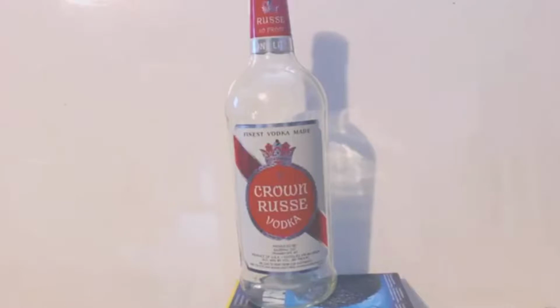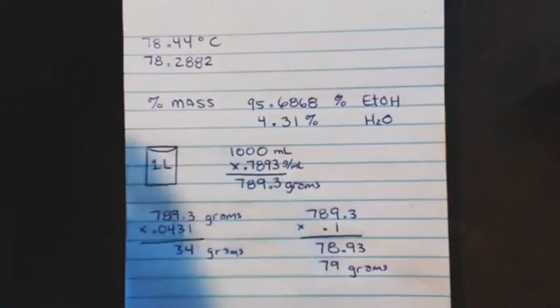Well, there it is. That's what I usually get, just some vodka, regular. Obviously, if you can get better alcohol, with a higher proof, do so. This is just what I had laying around, so I put it in the video. I get vodka because it's the cleanest alcohol you can get. Don't get those colored whiskey or rum or something. Get the clear vodka. You want the highest proof you can get. If you can get higher than 100 proof, get higher than 100 proof.